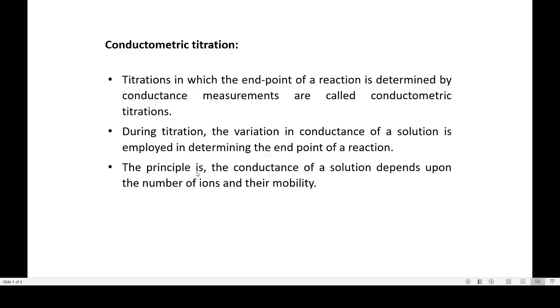The main principle is that the conductance of the solution depends upon the number of ions and their mobility. So, if there are more ions with high mobility, conductance will be very high. If the ion has less mobility, the conductance will be less.